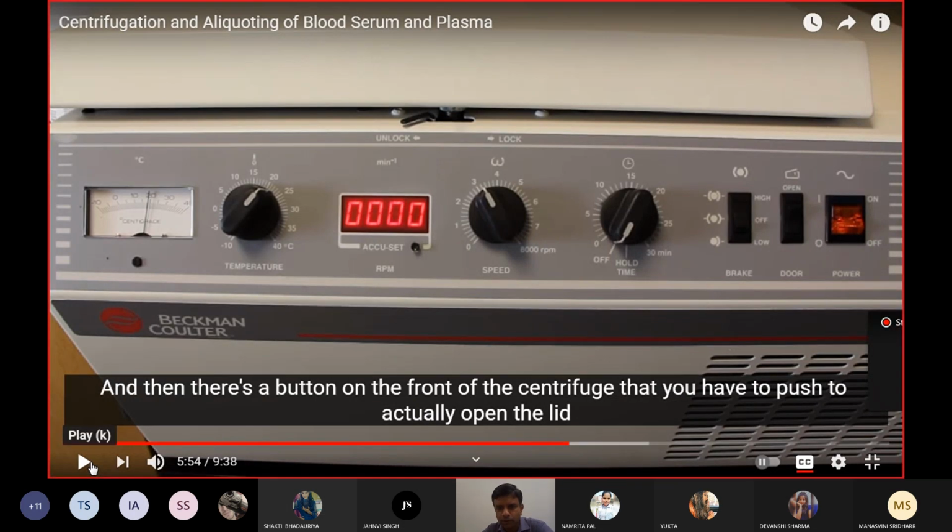Students, I'm sure you have seen those semi-automatic washing machines. There is a spinner in that machine, right? So what we do is we sometimes just open it before it has fully stopped, right? So you can do that in case of clothes, but in case of samples, it is not advised to open before it has stopped, right?